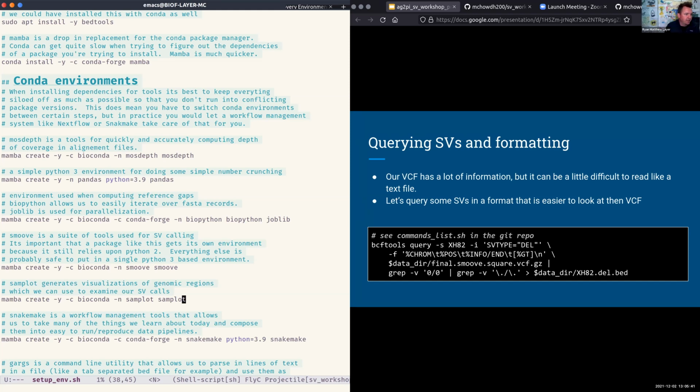And so these commands here that Murad has are assuming that you have Anaconda or Miniconda installed, assuming you got that far. And even if you're on a server or a machine that you don't have root access to, you'll still be able to follow these steps, except for the very first one, the bedtools one, you'll need root access for. But all the following steps you can install locally, just in your environment without administrative access. So that is in the setup script to follow.